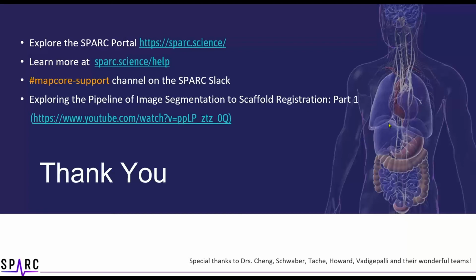But at the end of the day, for the purpose of the scaffold fitting and registration, we need some corresponding regions between data and scaffold in order to perform the process. Ideally, we want to have the correct anatomies for both data and scaffolds.